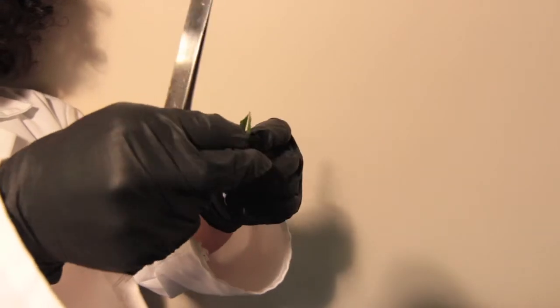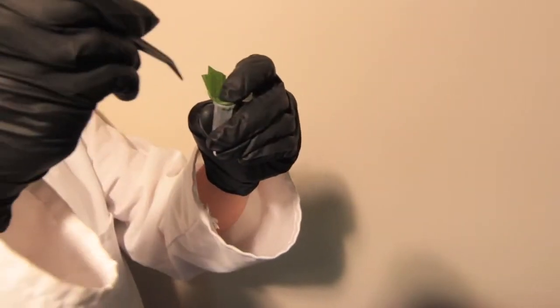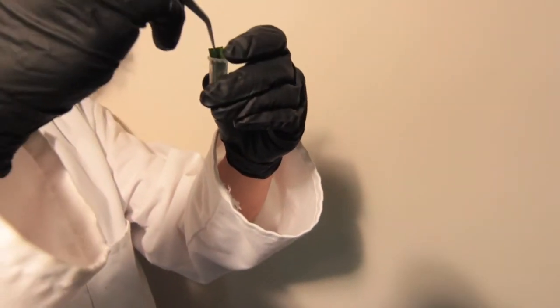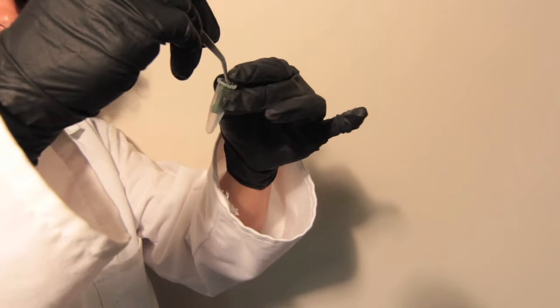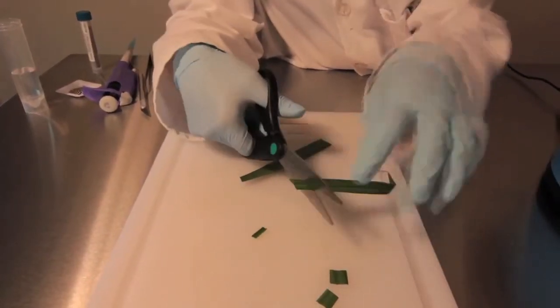One of the issues you may run into when preparing your samples for homogenization in the Bullet Blender is the low density of plant material. A small mass of sample may take up a lot of room inside of a tube. For this reason, it's best to keep your samples small.